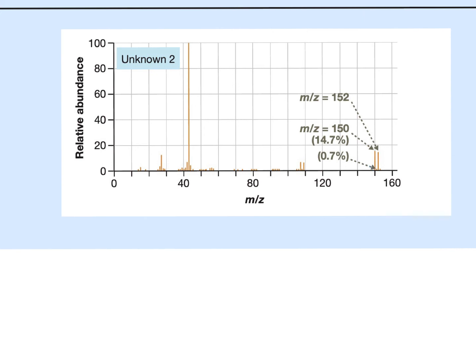Just from nothing else. So let's record some of this information, which is really helpful. So on that step 1, it says, are there 2 significant peaks separated by 2 atomic mass units at the high end mass of the spectrum? Why, yes, there are, right?